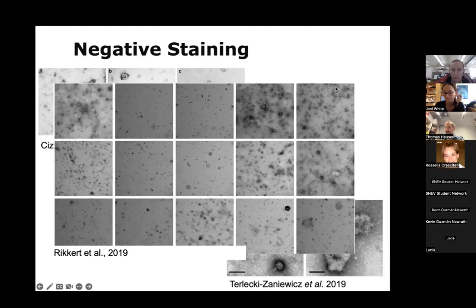And this is also the reason I would guess why on some of these regions some of these blobs seem darker, some of them seem brighter. That could also be differences in the size of the sample and also differences in how much stain stayed on the sample in these situations. Yeah, so we just recently had, or it's still ongoing, a project with a collaborator where we are exactly facing these questions. So the method is very good if you need quick feedback.